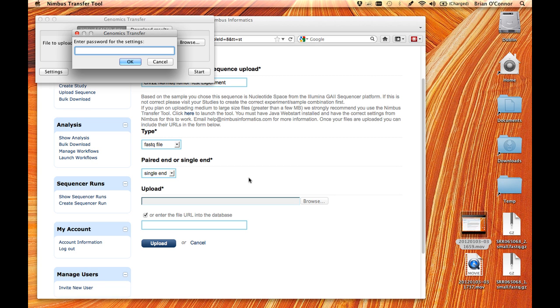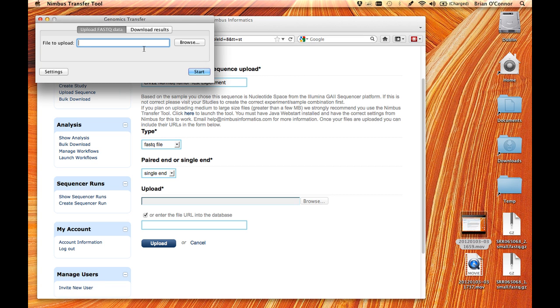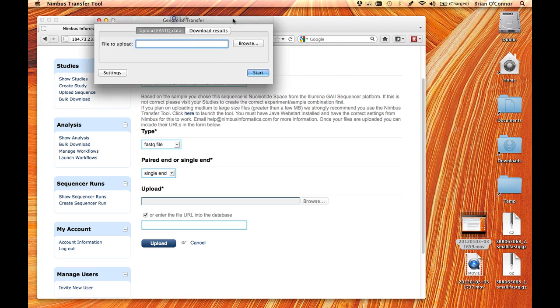So it's a good way to be regulatory compliant with the regulatory restrictions on medical data, for example, in the cloud. When you first set up this application, it will ask you for a username and just a password, and this is just encrypting your settings on the local disk. So I'm just going to enter my password, and since I've set this up before, it's not going to prompt me for that initial information.